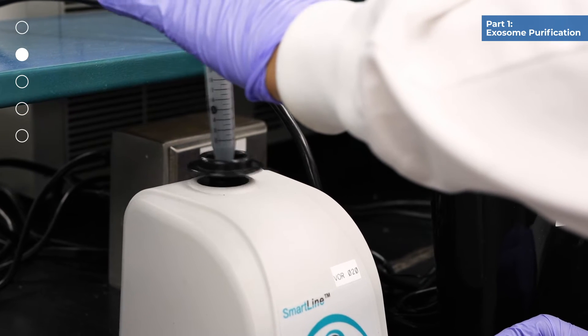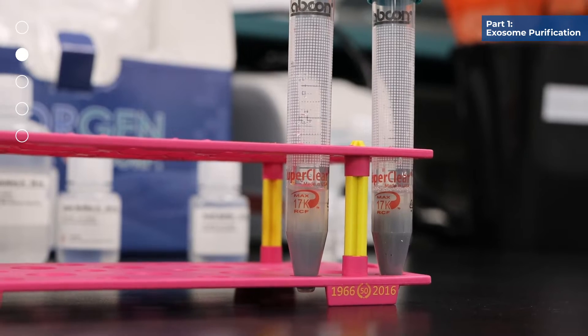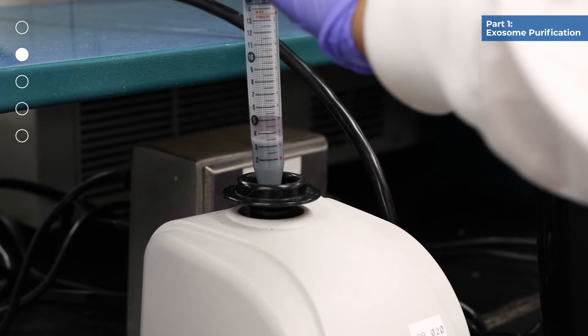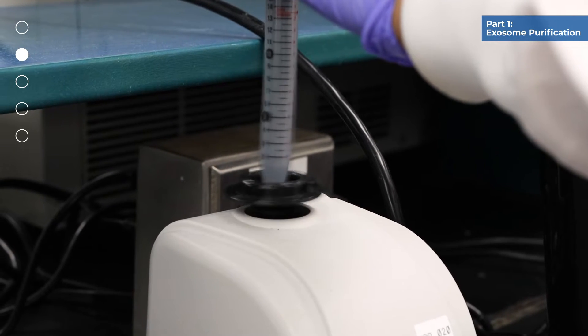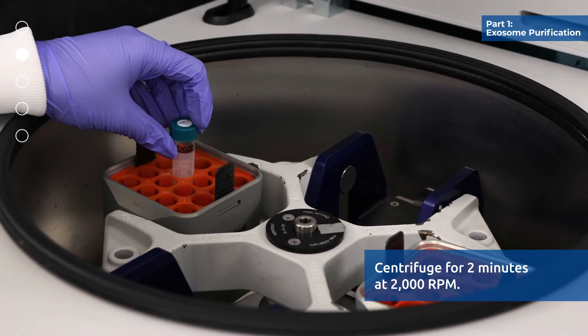Mix well by vortexing for 10 seconds and let stand at room temperature for 5 minutes. Mix well by vortexing for 10 seconds. Centrifuge for 2 minutes at 2000 rpm.